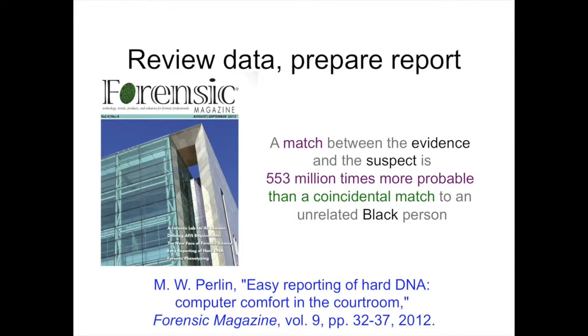So what do you do once you've got these results? You've got these matches before you've ever had to see your data. You can see your data at the same time as you saw that match statistic of 1 million to someone. So then you can start to prepare a case report. And this is just the language that we found is the easiest to convey to a layperson.